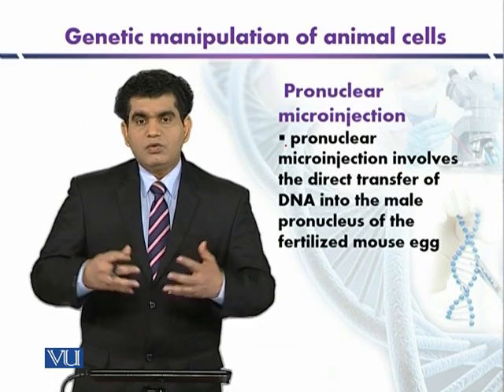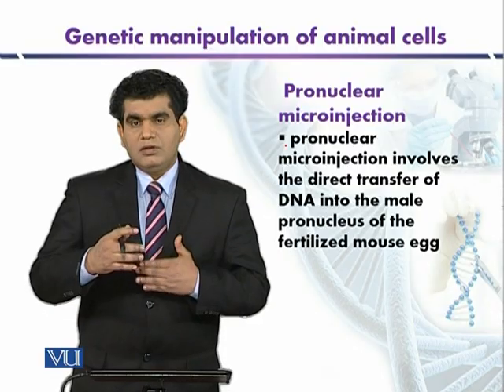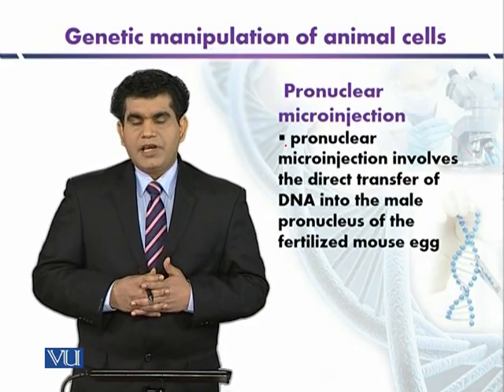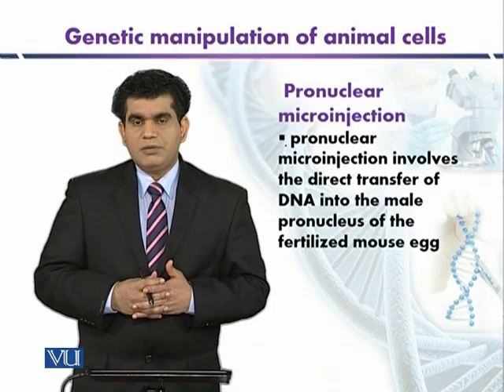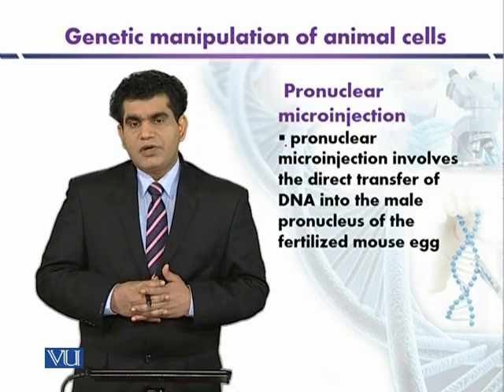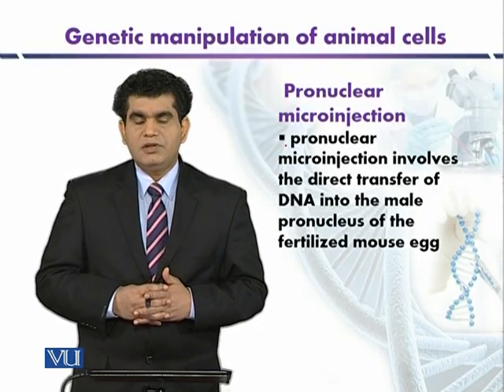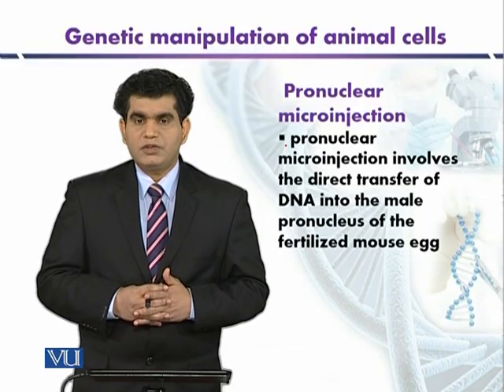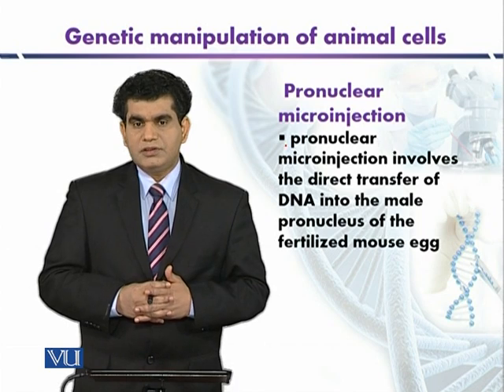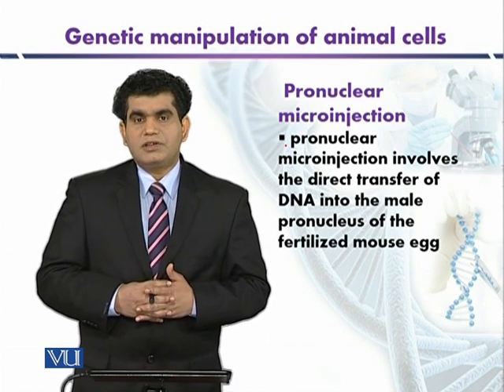So as I told you, after implantation, some cell lines may be transfected while some cells remain unaffected. But overall we can say that the transfection efficiency may be 5 to 40%. So this is one of the methods by which fertilized egg cells can be transfected.